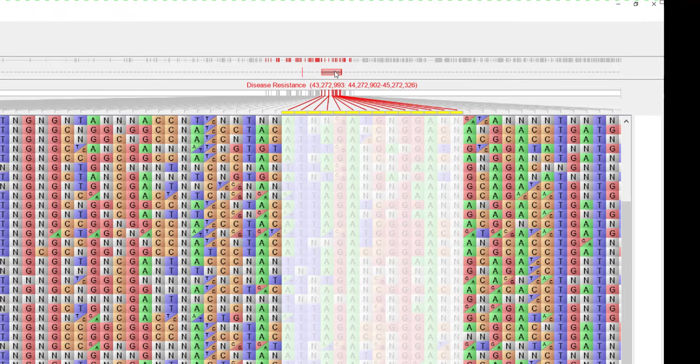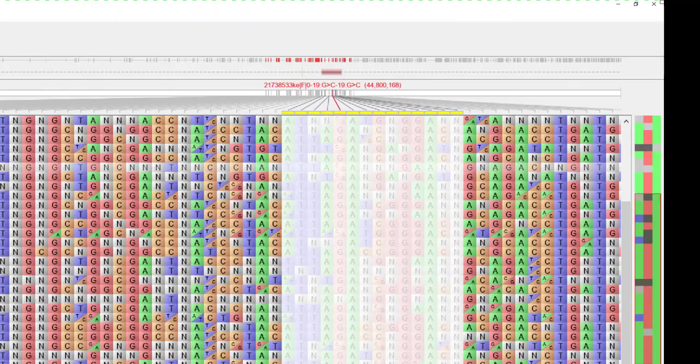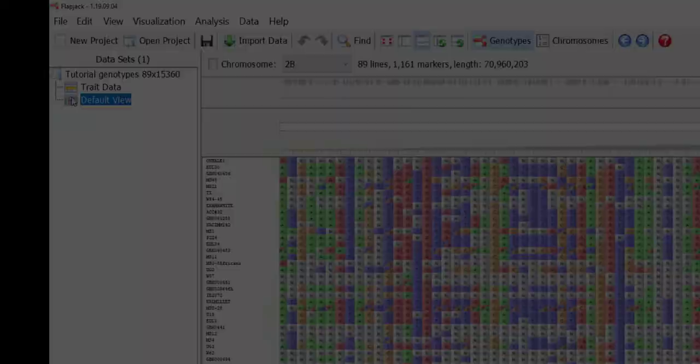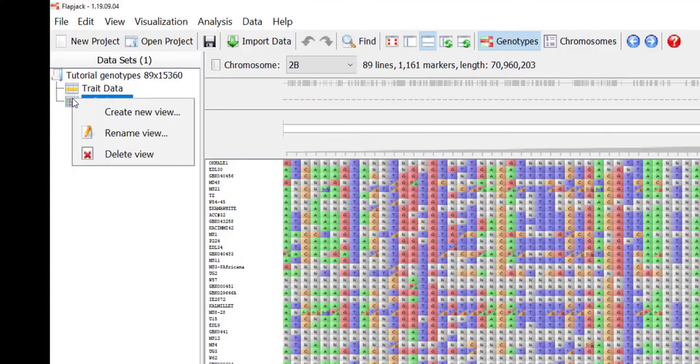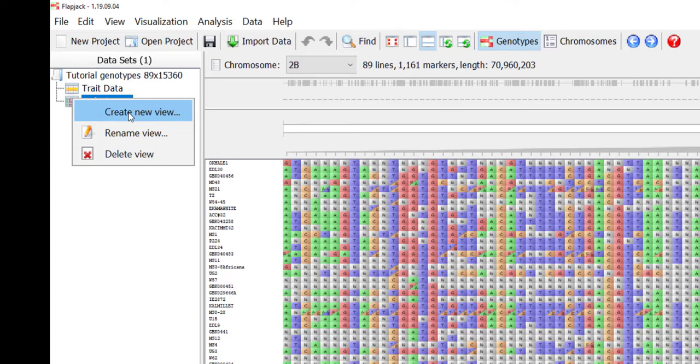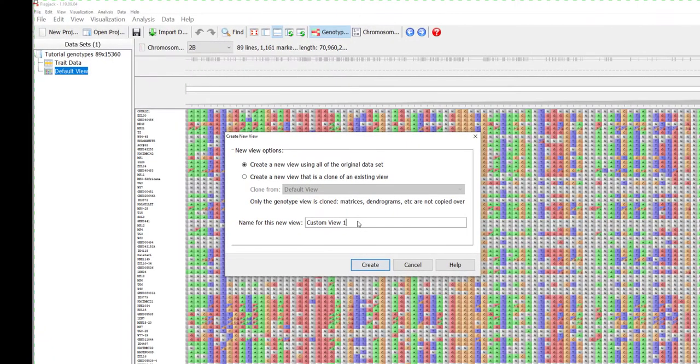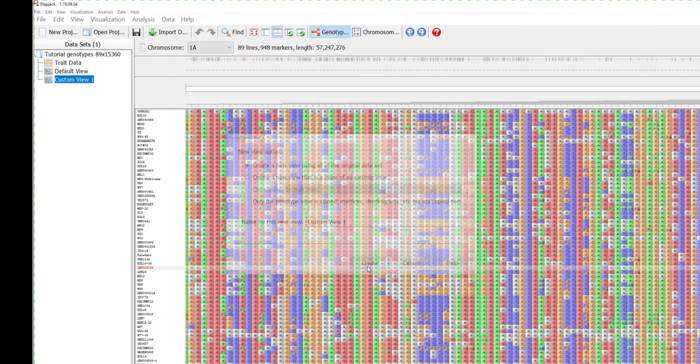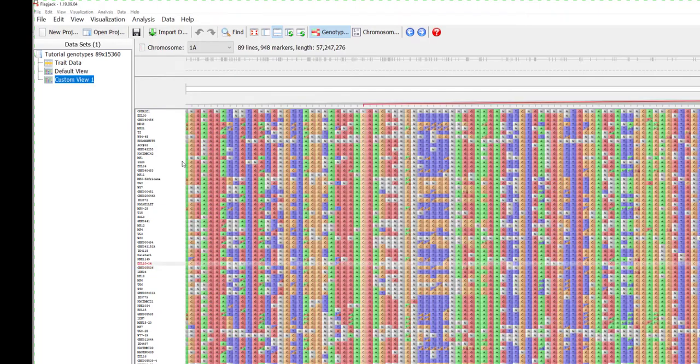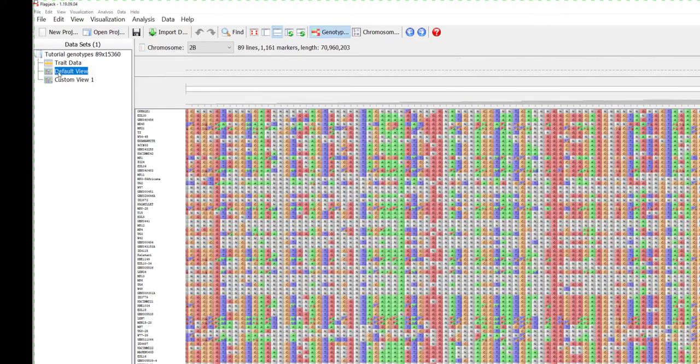Clicking on the QTL displays markers involved with this feature. It's possible to create multiple views of your data to allow for various analysis within one project by right clicking on default view in the dataset window and selecting create new view. An option for naming your duplicate dataset is available.